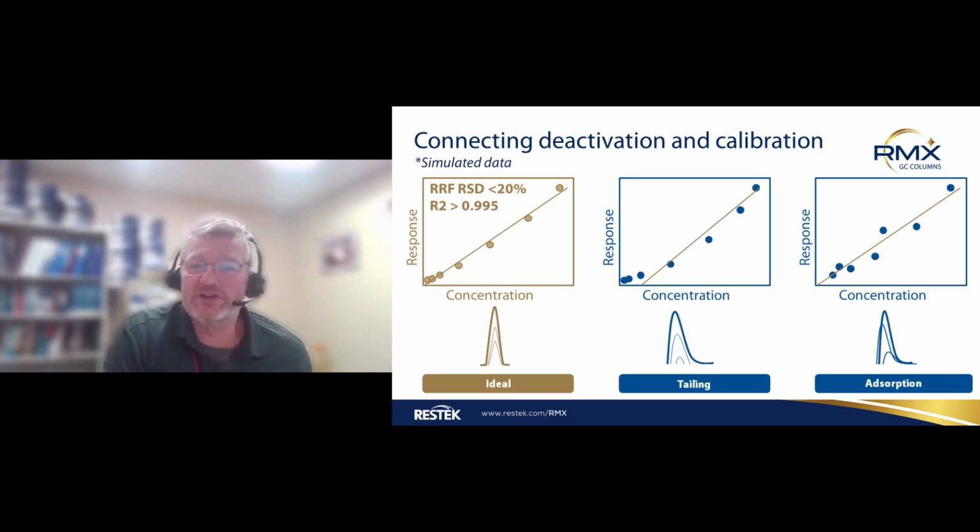And then again, with lower concentration and also having a linear response, we all know we can get a good linear calibration if we are running at higher concentrations. If we're calibrating from 5 nanograms to 200 nanograms, chances are good we're going to have a good linear calibration for all of our compounds. But let's say we're going down to picogram levels, single or double digit picogram levels. That's where this lower concentration, it's much harder to get a linear response.